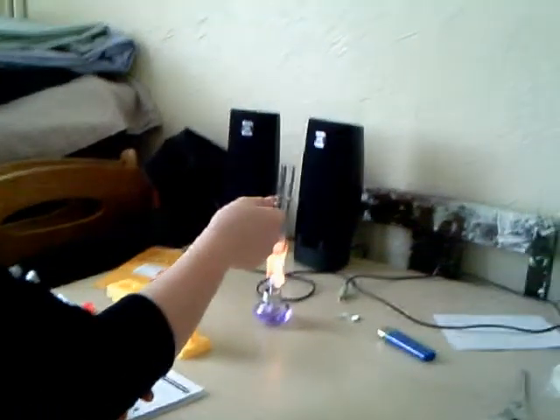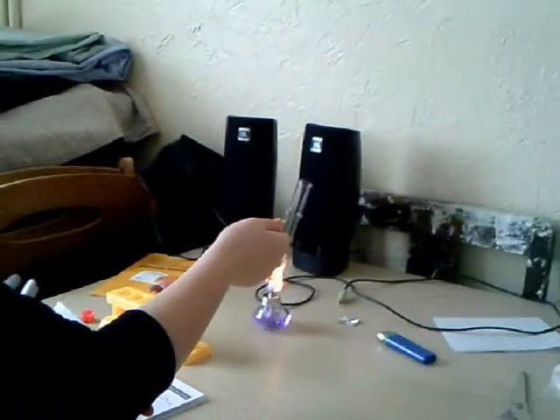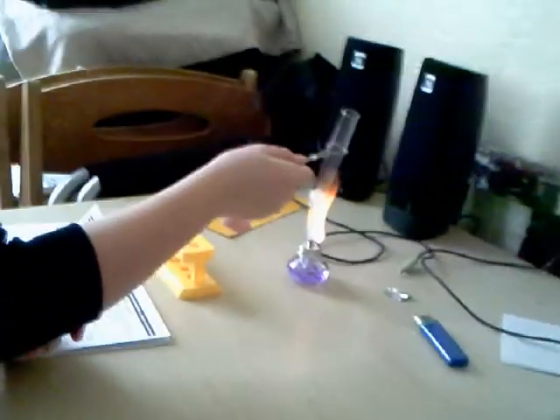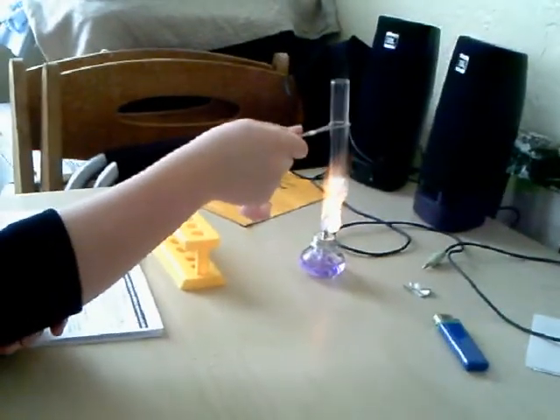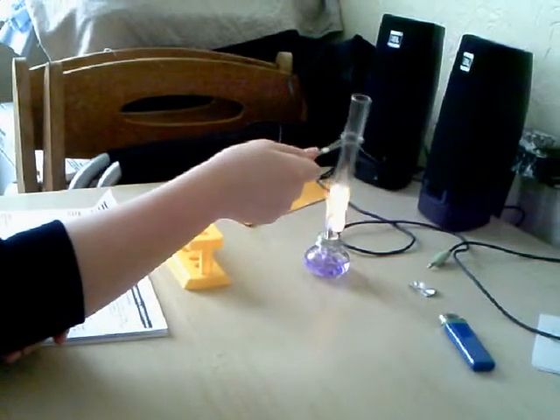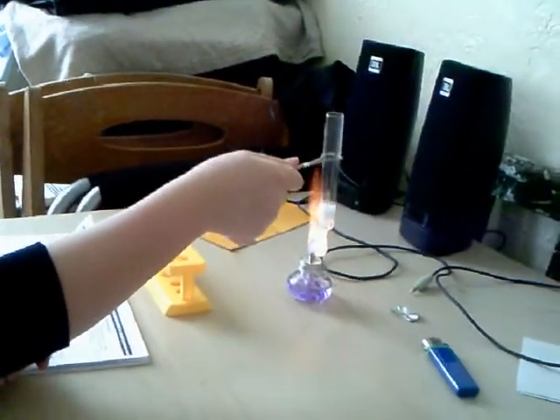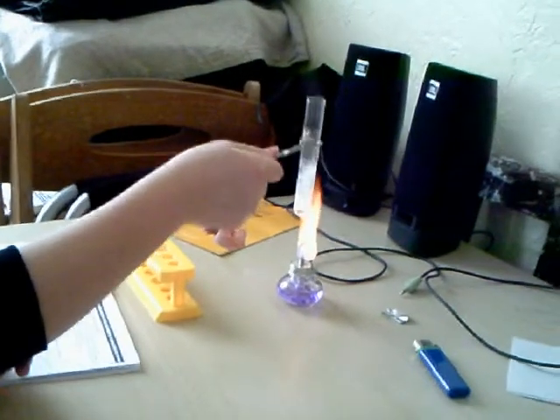In the first experiment, we added 2cm of magnesium strip to 2cm of vinegar in a test tube. First we started shaking it, and then as you can see we started heating it. After we started heating it, we left it for 30 seconds with the lid kind of on and off.